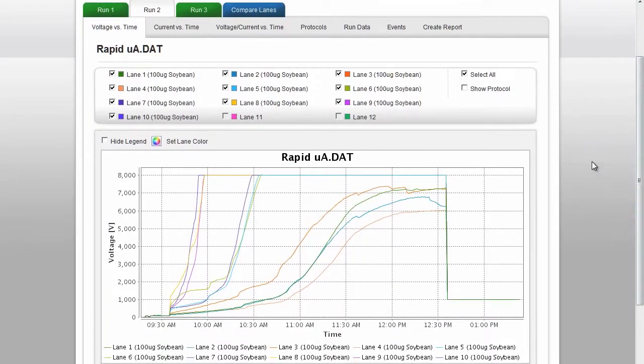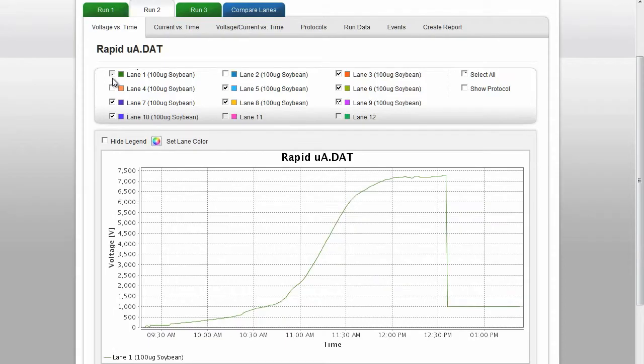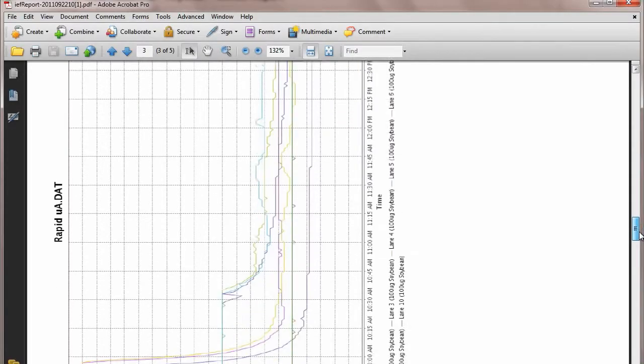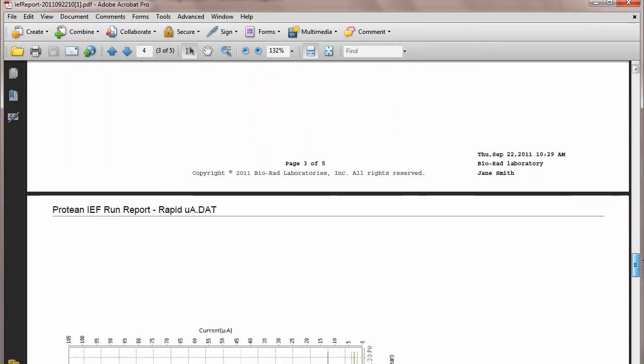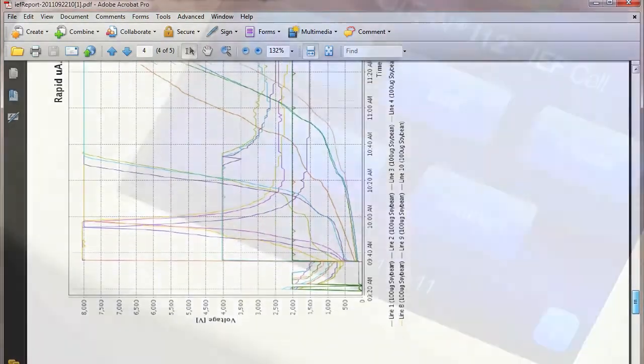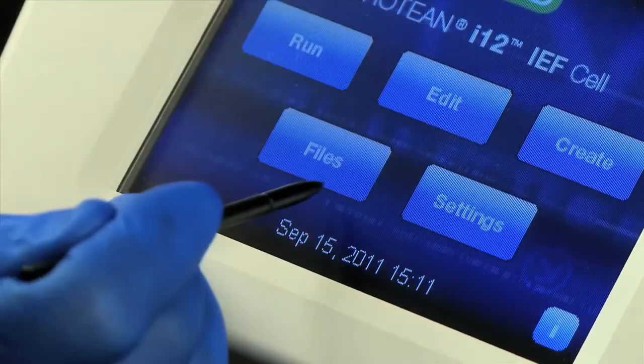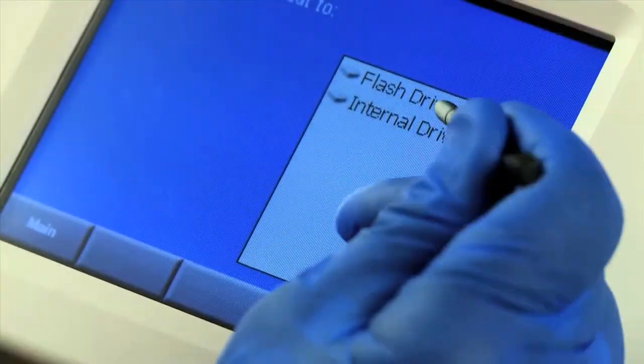It can be used to display the electronic run profiles for each lane, compare data from different runs, and generate and print reports.